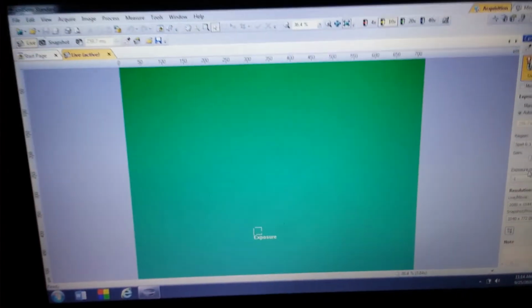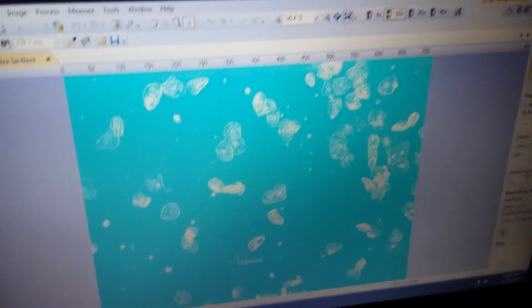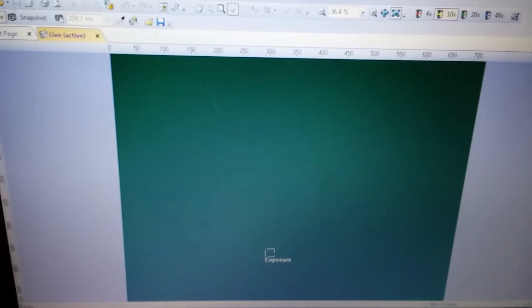And then this is what I see with plate number 1. There is no fluorescence. But if I toggle on the white light and I turn up the white light, I'll notice that there are cells. They're just not fluorescing because they didn't get Triton, and the same for the plate that didn't get phalloidin. So if they didn't get Triton or they didn't get phalloidin in the presence of Triton, they don't glow green.